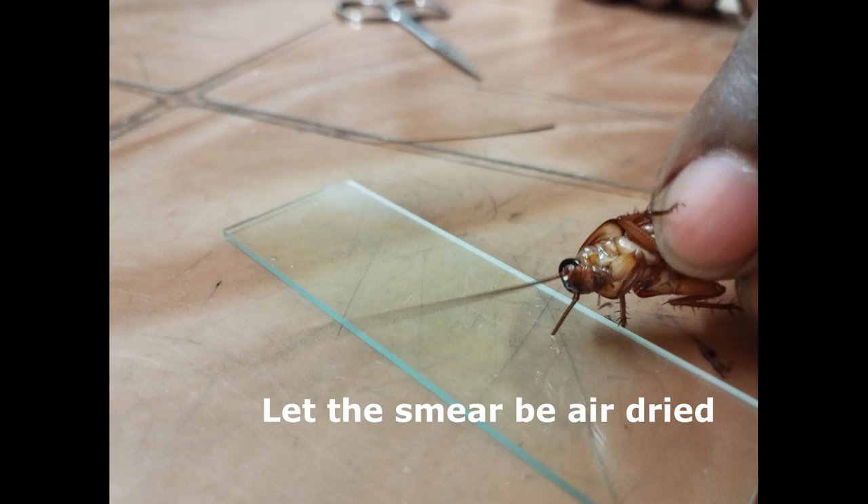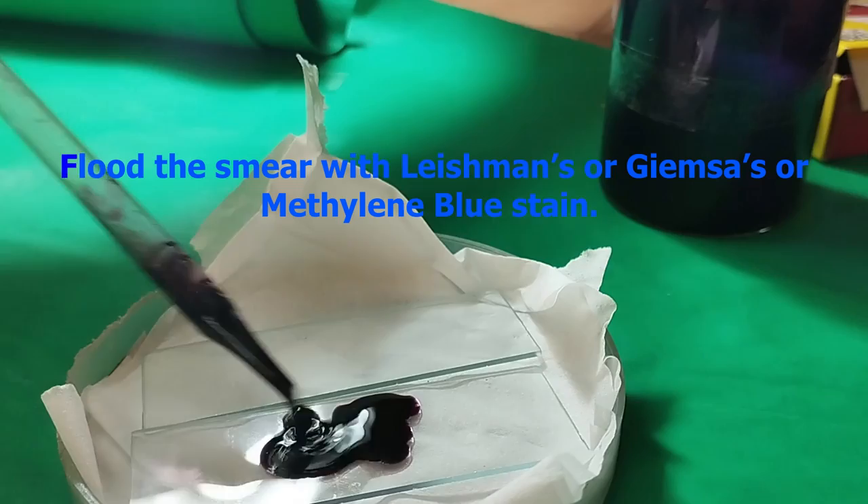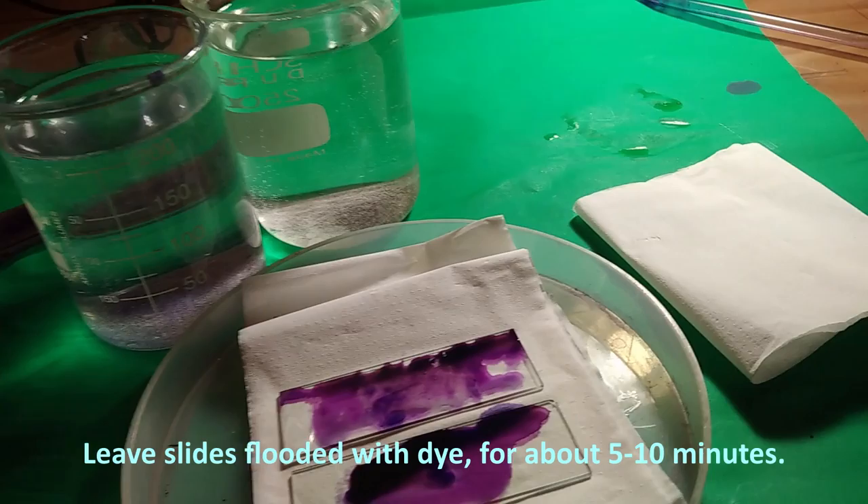Flood the smear with your desired stain — Leishman, Giemsa, or Methylene Blue, whatever you prefer — and leave the slides flooded with dye for about 5 to 10 minutes.